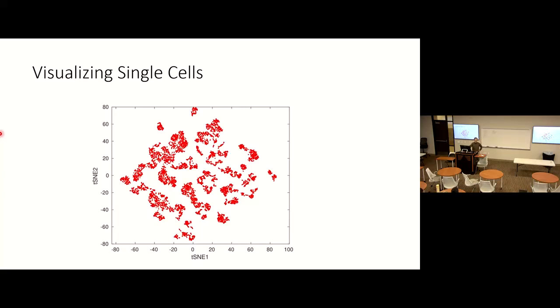If you look at this visualization, you find small clusters for different potential subtypes of cells. So this gives you the foundation for your clustering analysis. And we know if you run PCA on this, you will not be able to separate those cells so clearly.